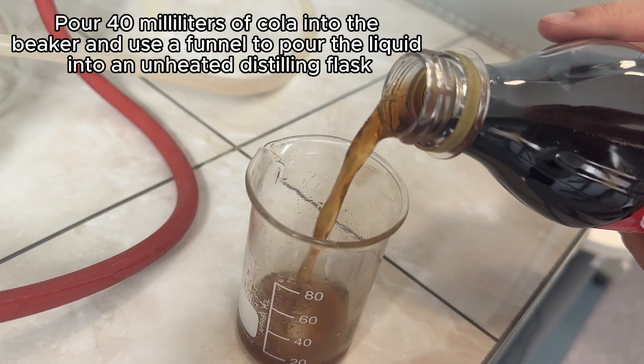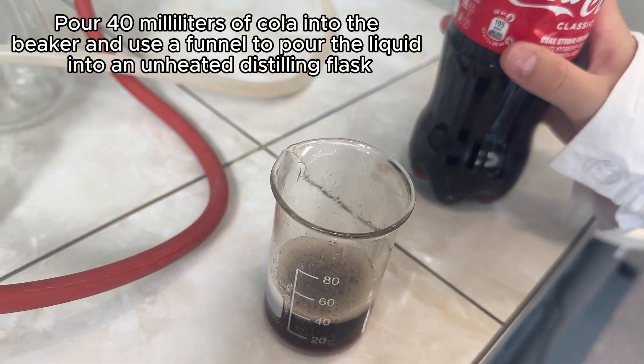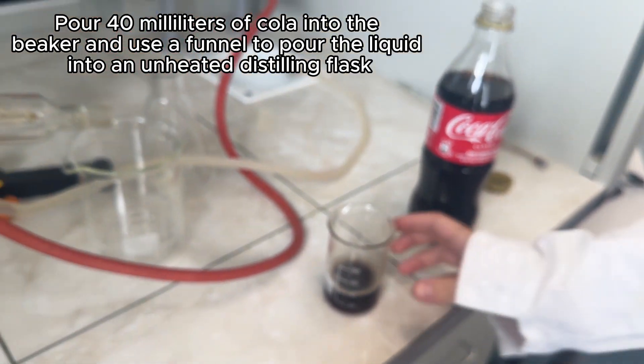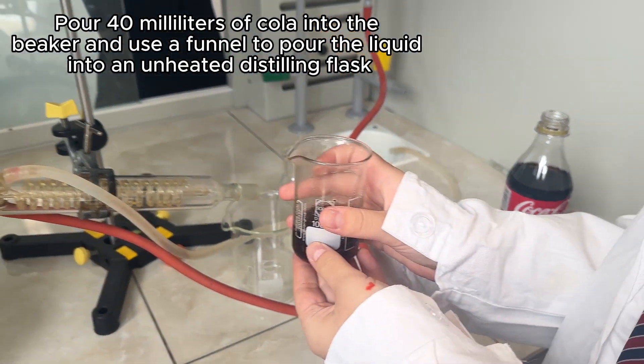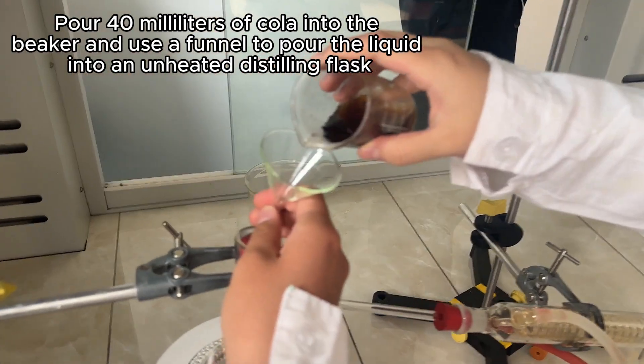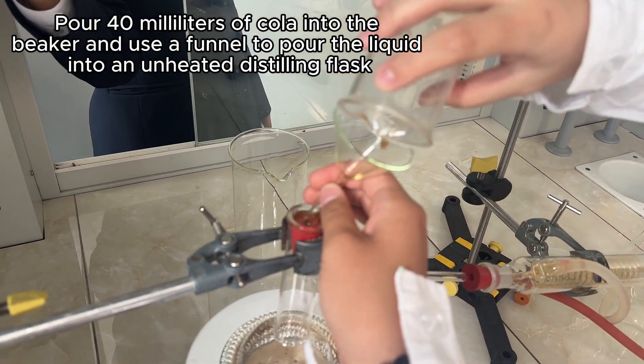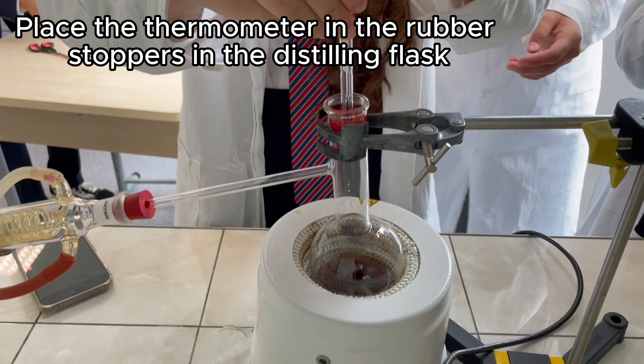Pour 40 ml of cola into the beaker and use a funnel to pour the liquid into the distilling flask. Place the thermometer in the distilling flask.